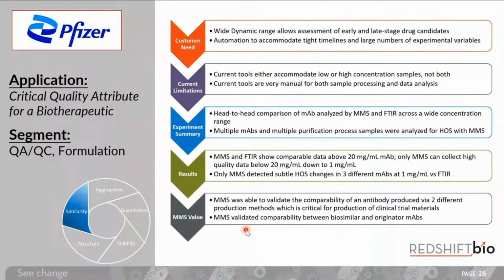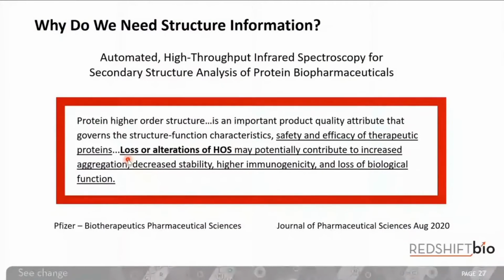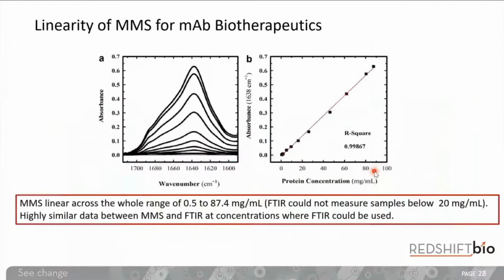Quick study from Pfizer, looking at critical quality attributes, CQAs, for their biotherapeutics. They wanted to look at linearity. They wanted to look at reproducibility. Again, a quote from the paper, safety and efficacy of therapeutics. It's really critical to understand the higher order structure or any alterations in that higher order structure so that you can understand aggregation, immunogenicity, and loss of function.